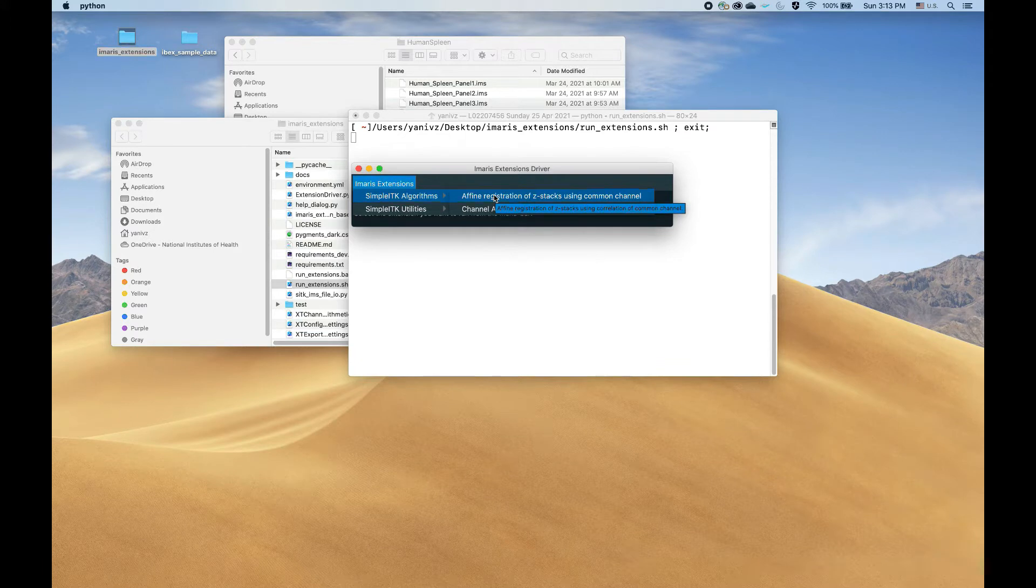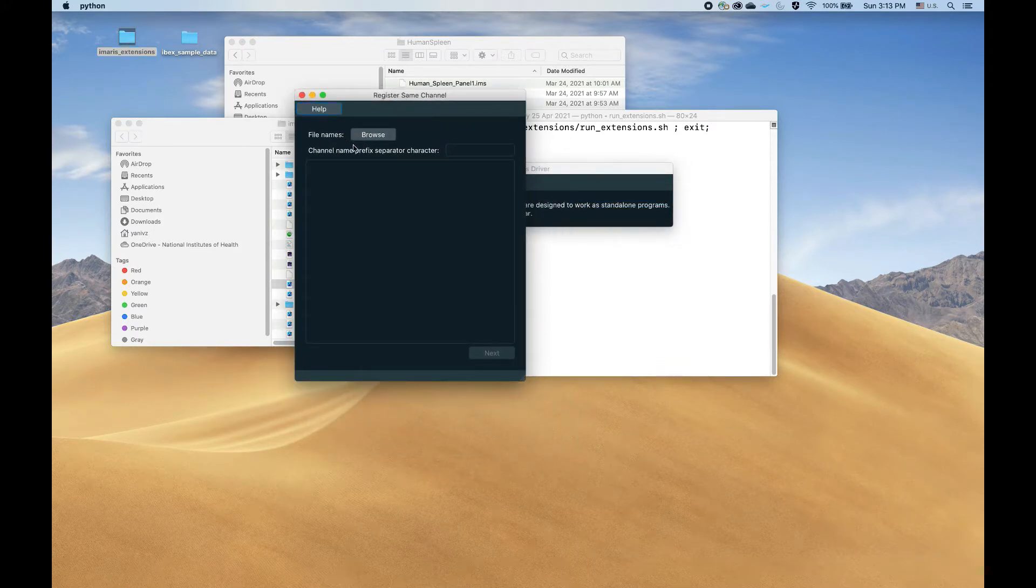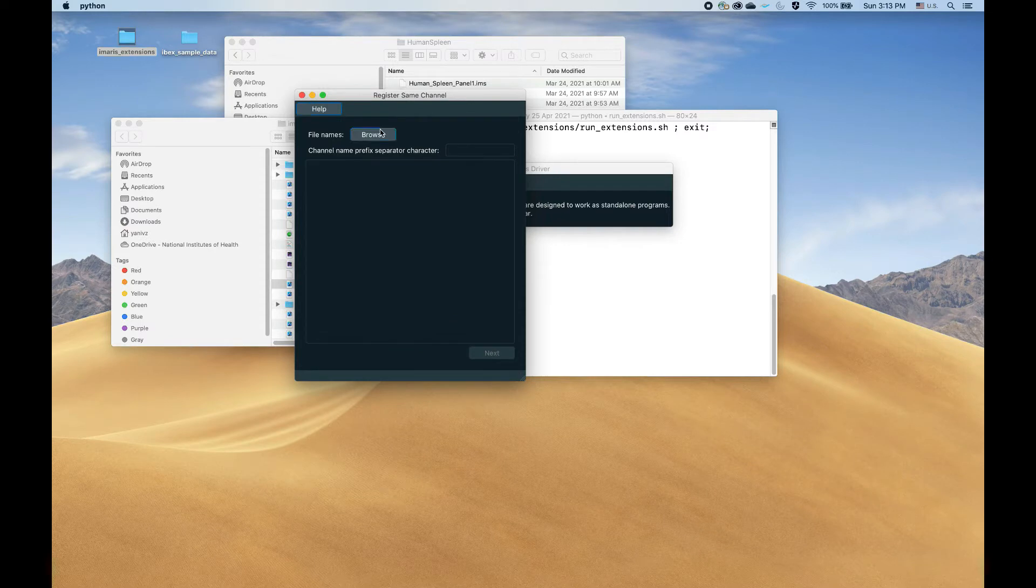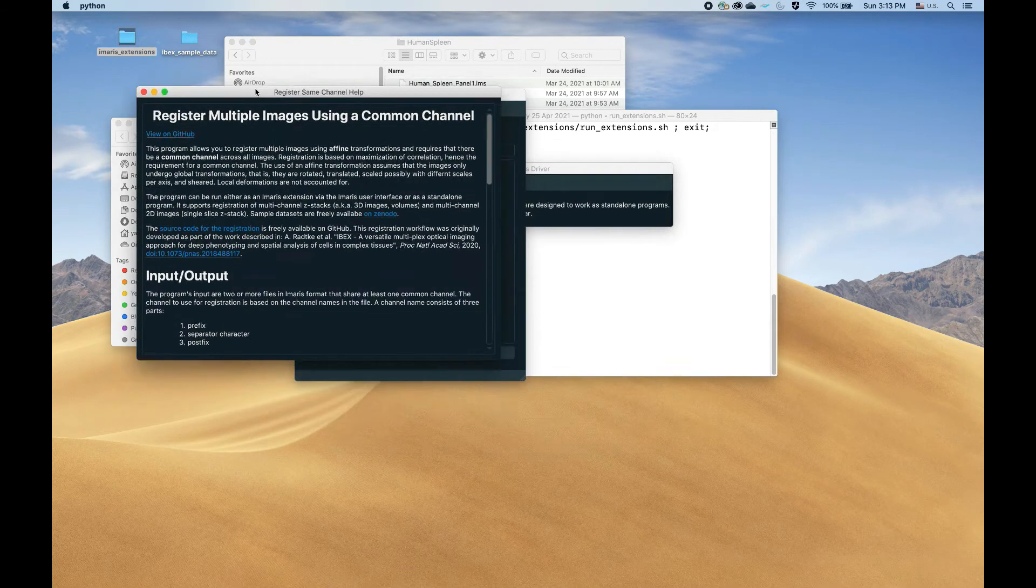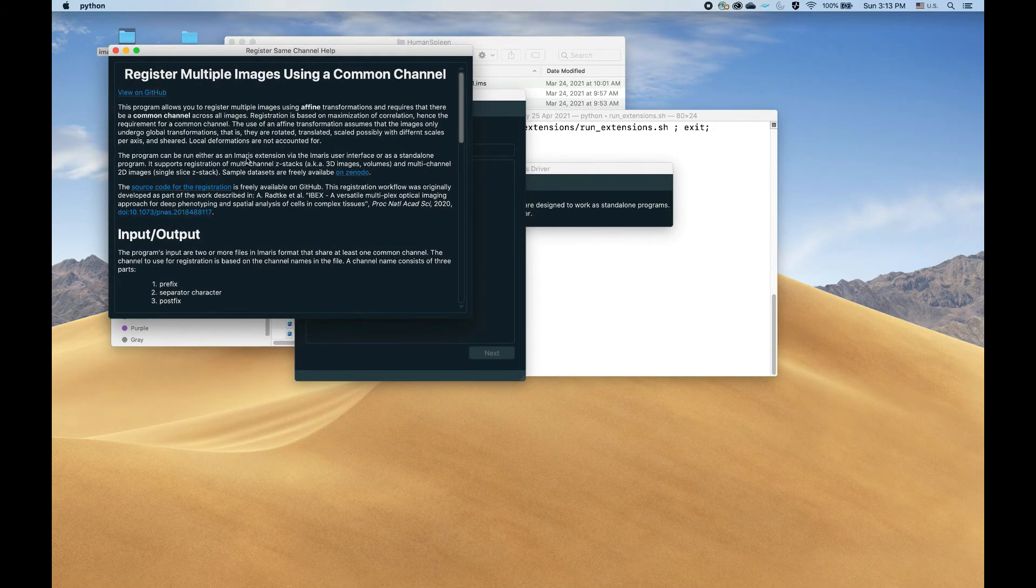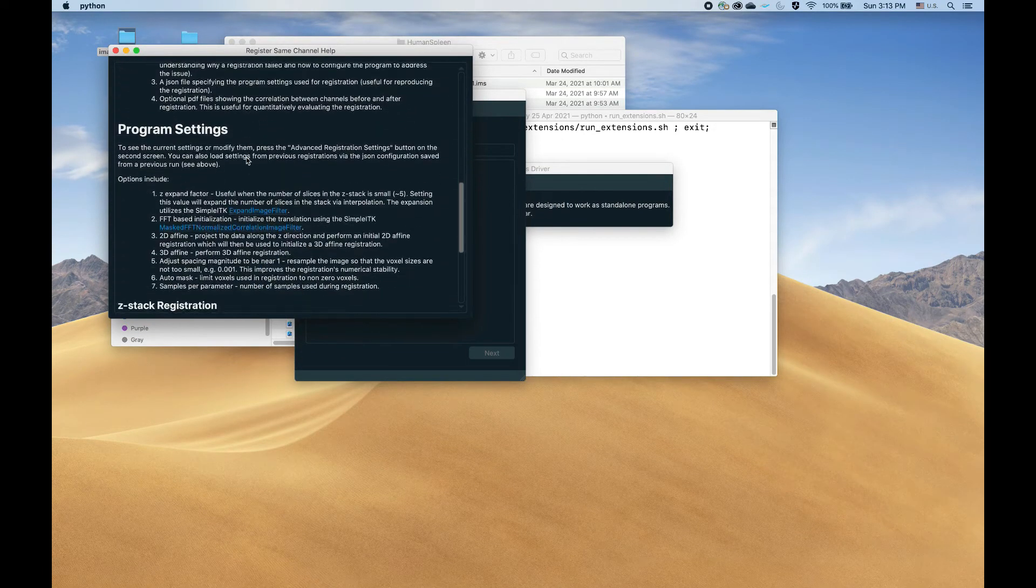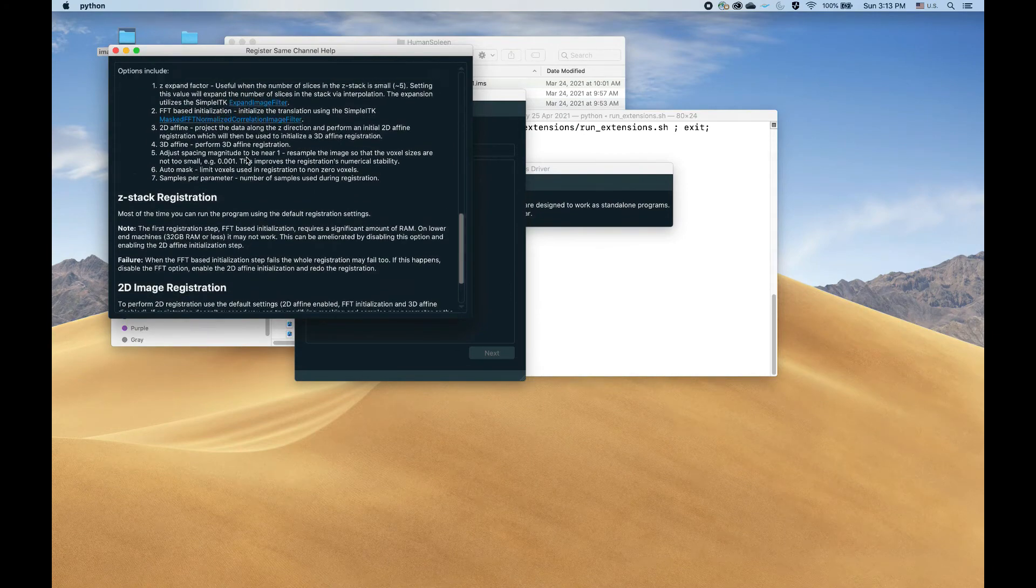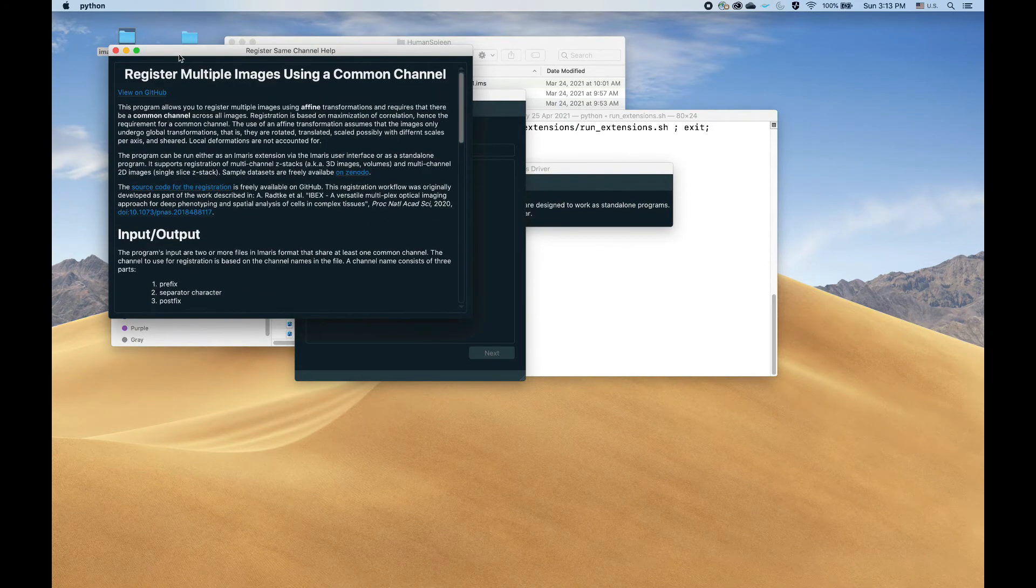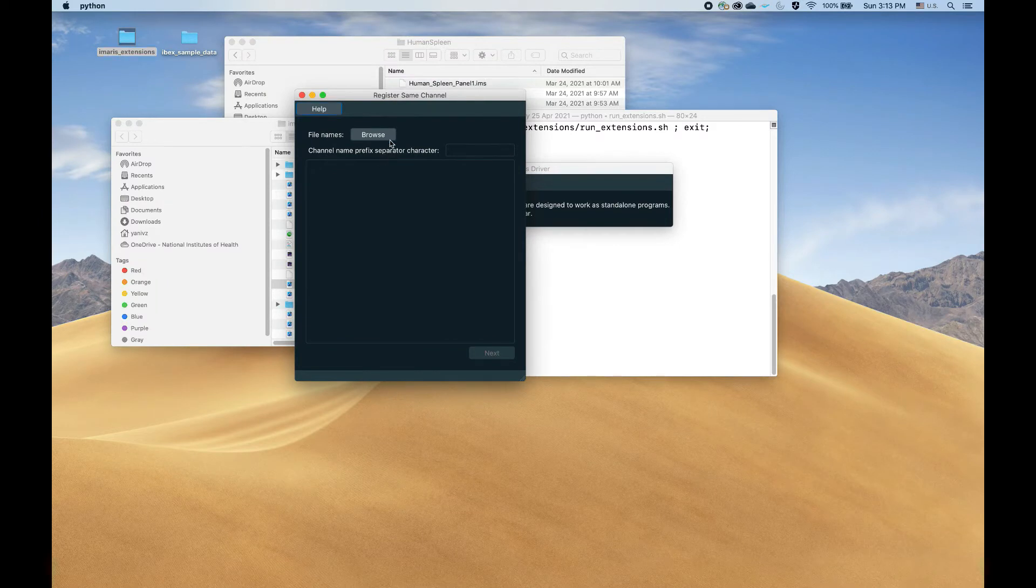At any point in time if you need help, you're not sure what to do next, or you've encountered a failure mode, everything is addressed in help. Under the help menu, you've got all kinds of instructions, possible failure modes, and how to resolve them.